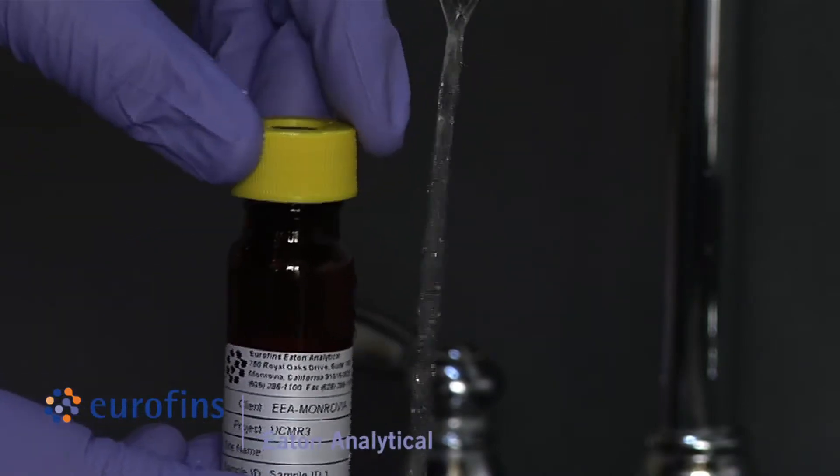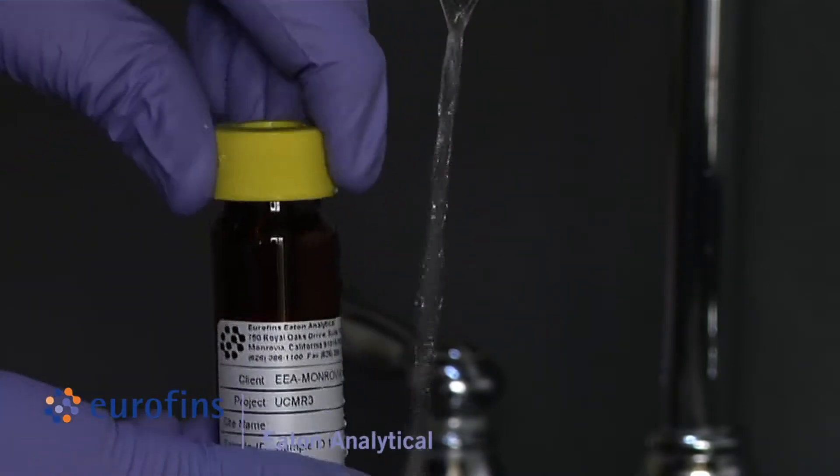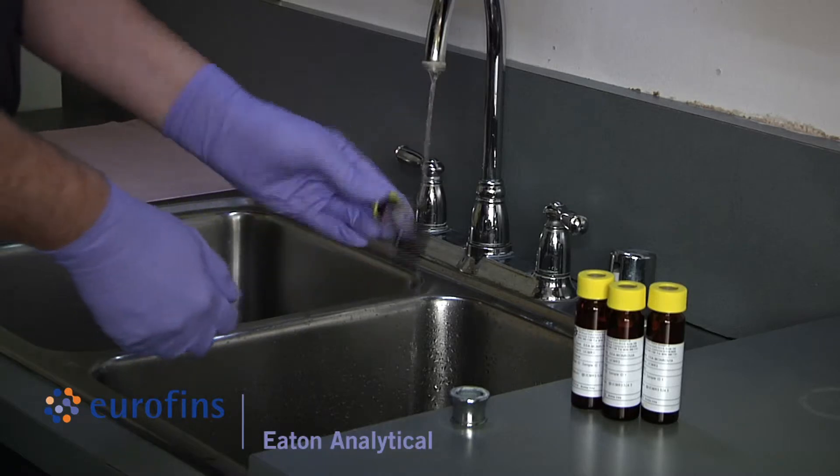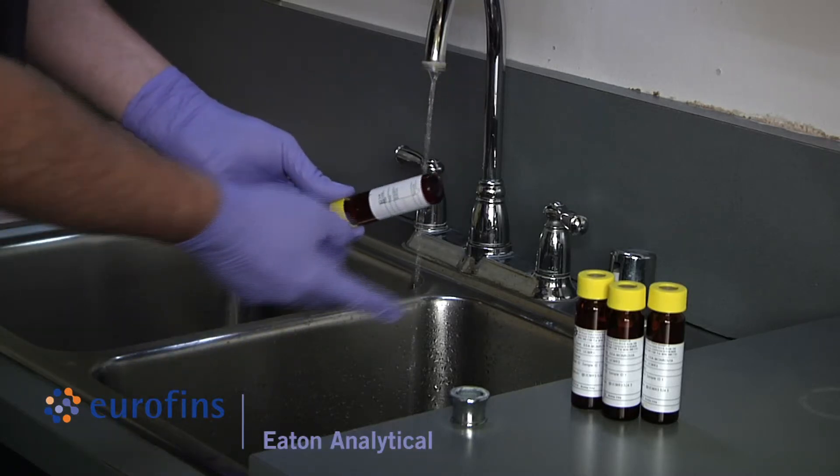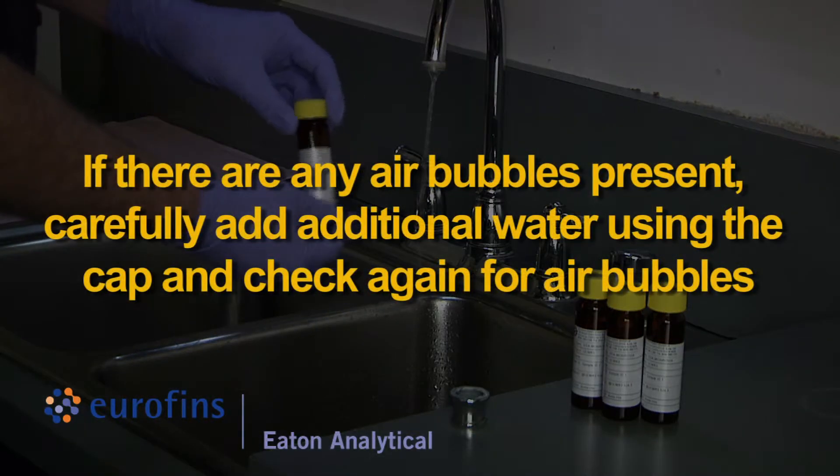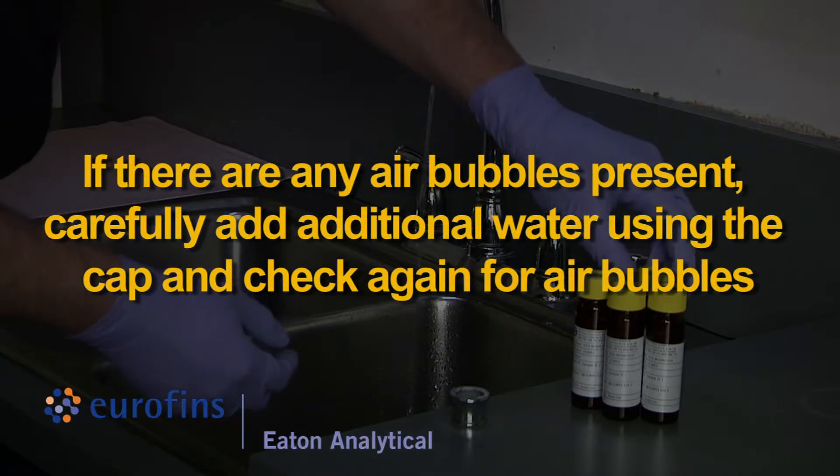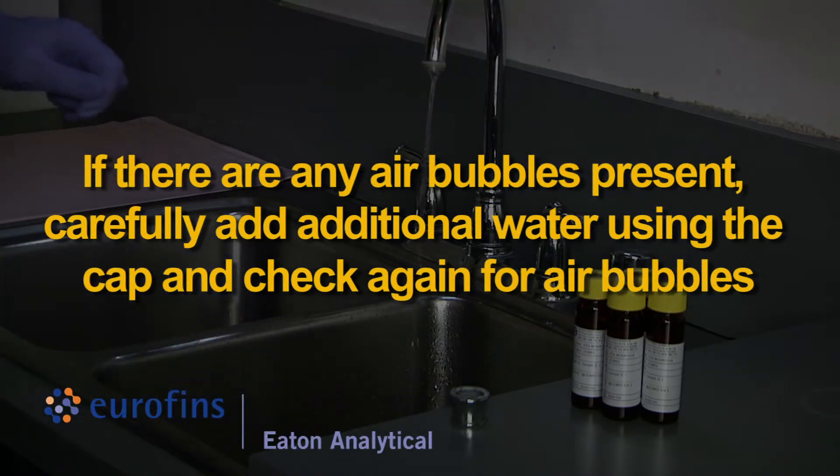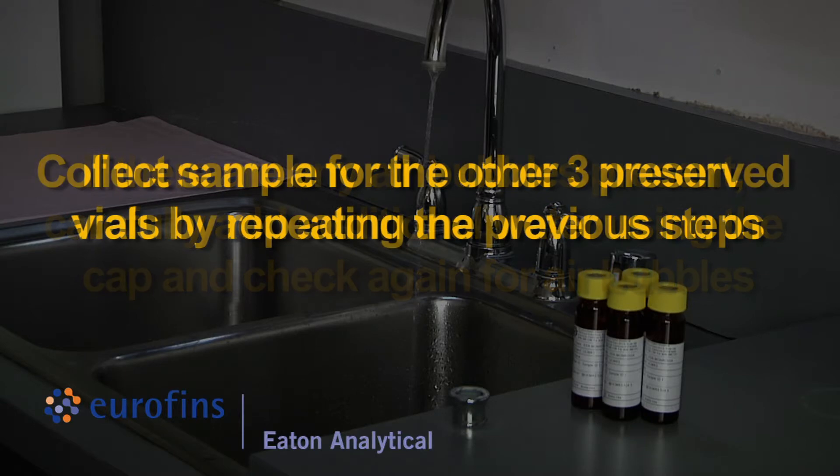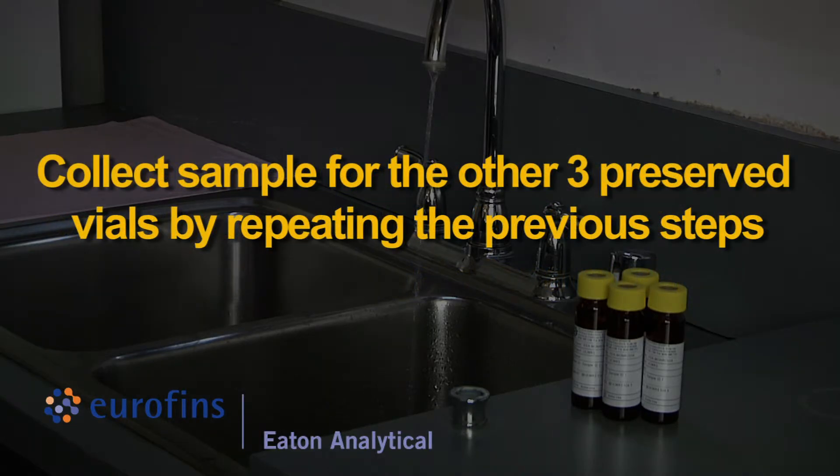Cap the sample vial tightly. Gently invert and tap the vial to check for air bubbles in the sealed vial. If there are any air bubbles present, carefully add additional water using the cap and check again for air bubbles. Collect samples for the other three preserved vials by repeating the previous steps.